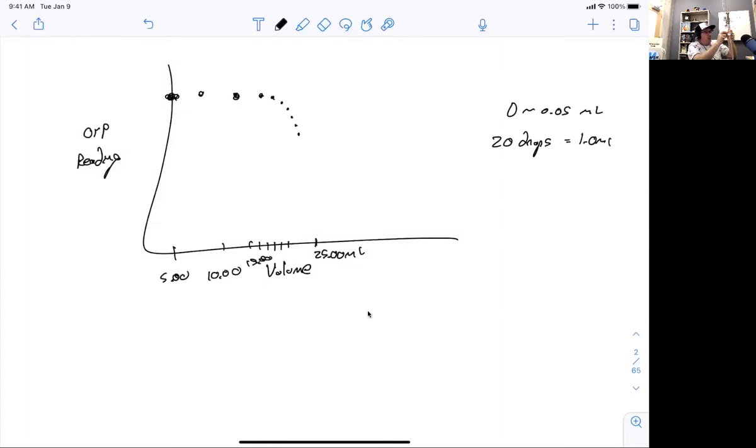Also notice that the stopcock is not necessarily either open or closed. You can find a gray area where it's slowly dripping. If you have it wide open, 5 milliliters will go pretty quick. So you might want to find some middle area where it's going drop-wise, and so you get a little bit more control.